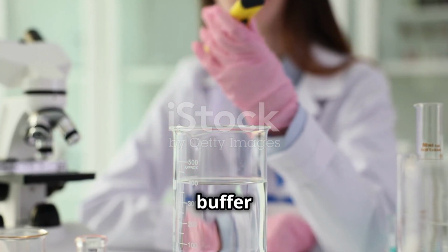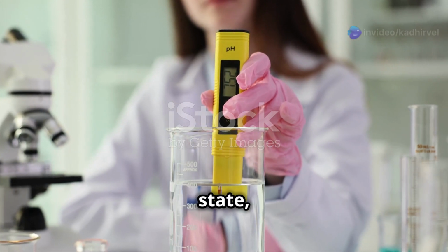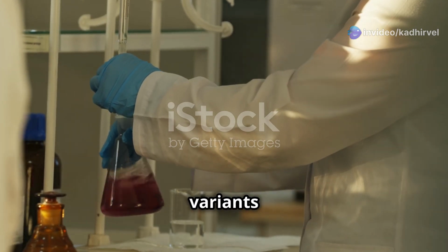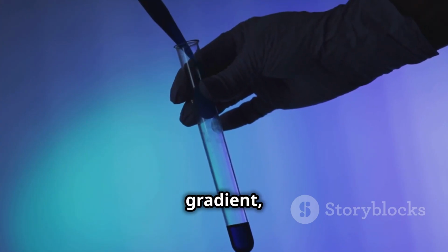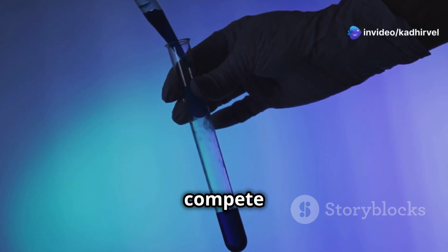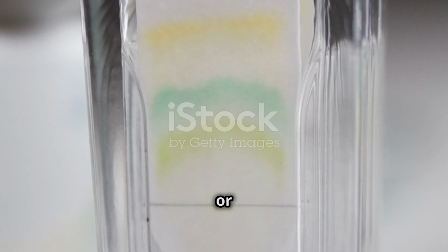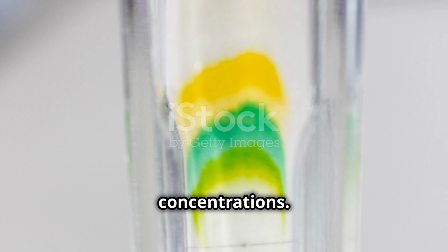The pH of the buffer in CEX is chosen to ensure the mAb and its variants are in a protonated state, or positively charged. However, small charge differences between the main mAb and acidic variants cause them to bind with different affinities to the resin. As a salt gradient, such as NaCl, is applied, the positively charged ions from the salt compete with the mAb molecules for binding to the negatively charged resin. Variants with weaker positive charges, or acidic variants, are displaced more easily and elute at lower salt concentrations.